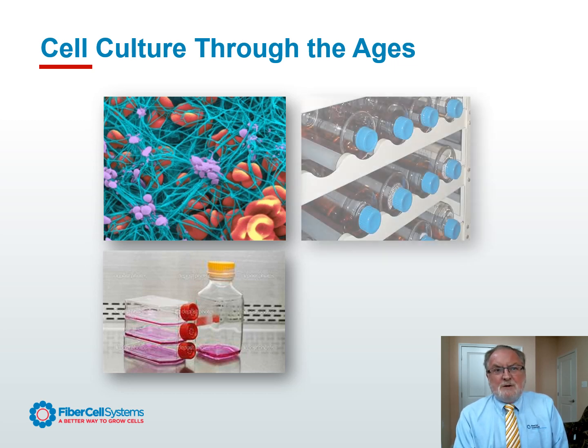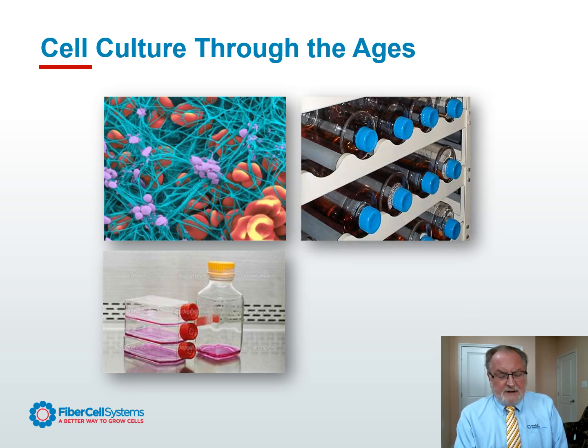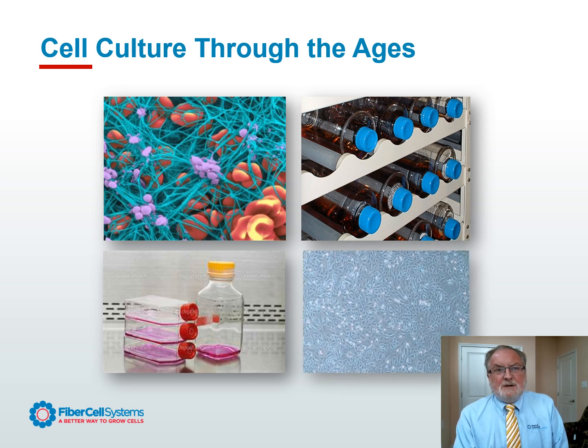If we want to culture more cells, we just have to have more surface area. But current two-dimensional cell culture technology is based upon the culturing of cells on non-porous two-dimensional plastic surfaces in a subconfluent state in the presence of fetal bovine serum. This is not a physiologic way to recapitulate in vivo cell culture conditions.